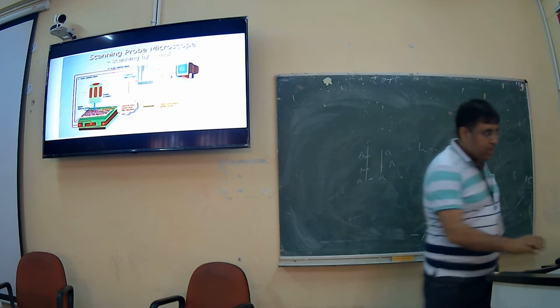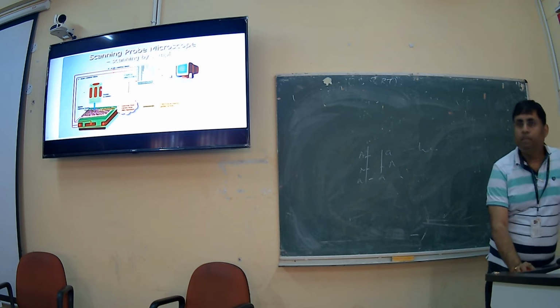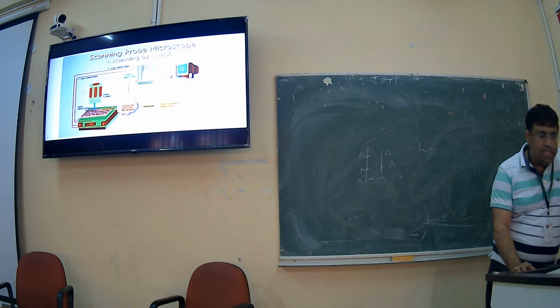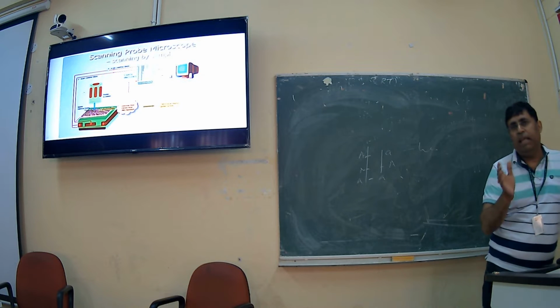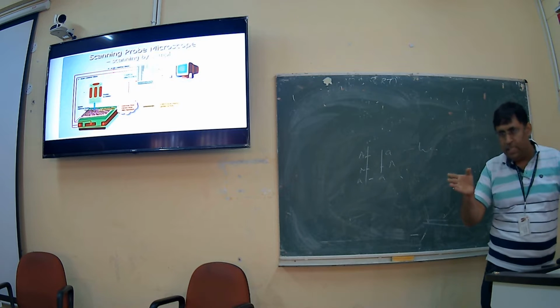Here you can see this is the probe scanner. This is the specimen, and here there is an X control line which will help in controlling the movement of the probe on the X-axis.